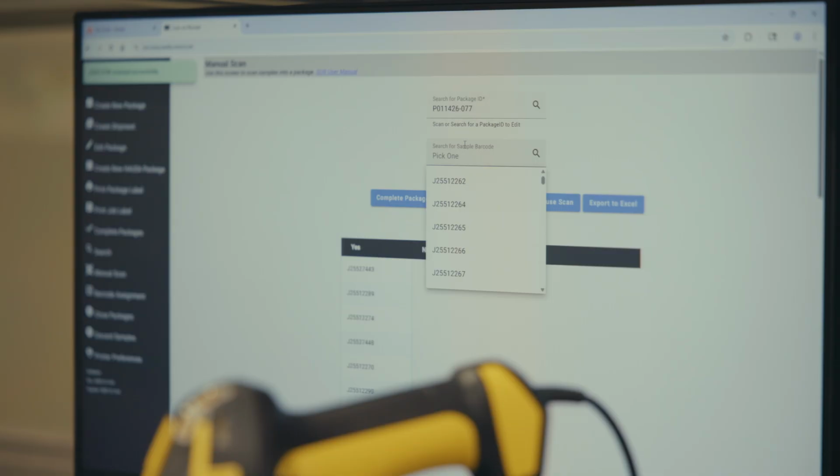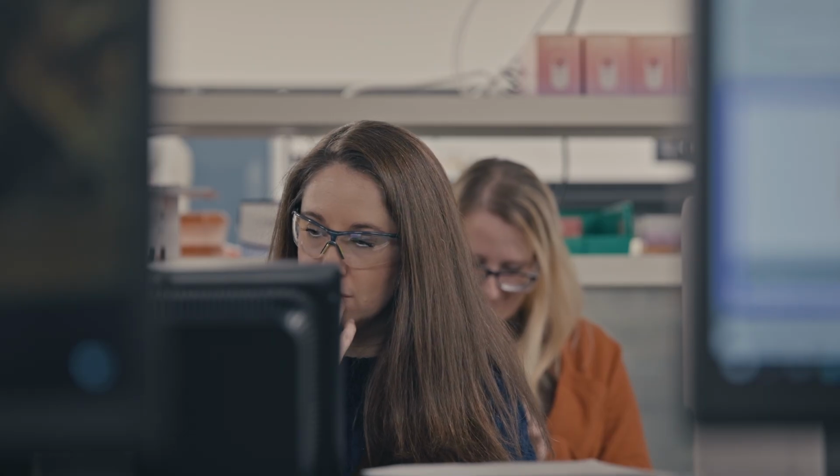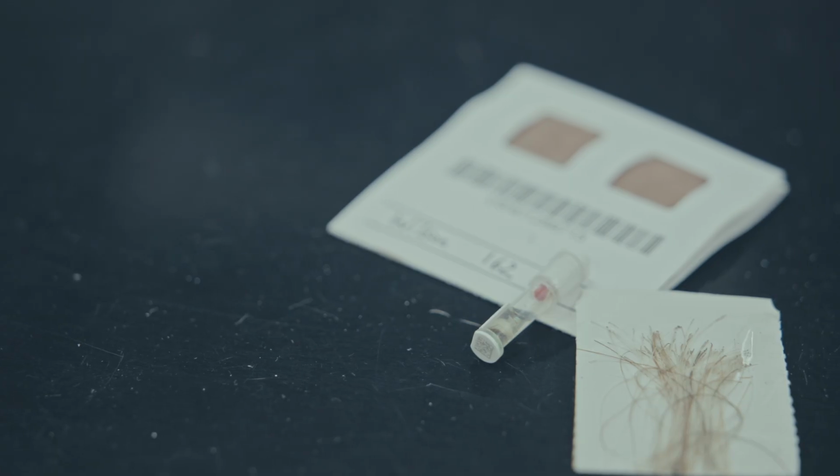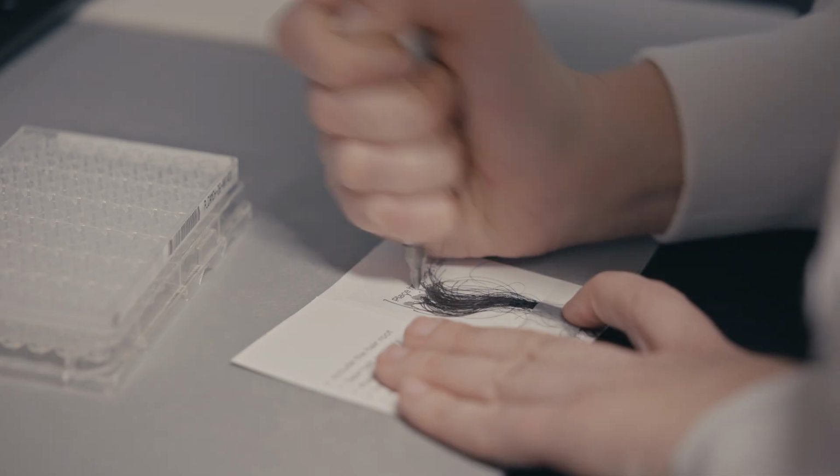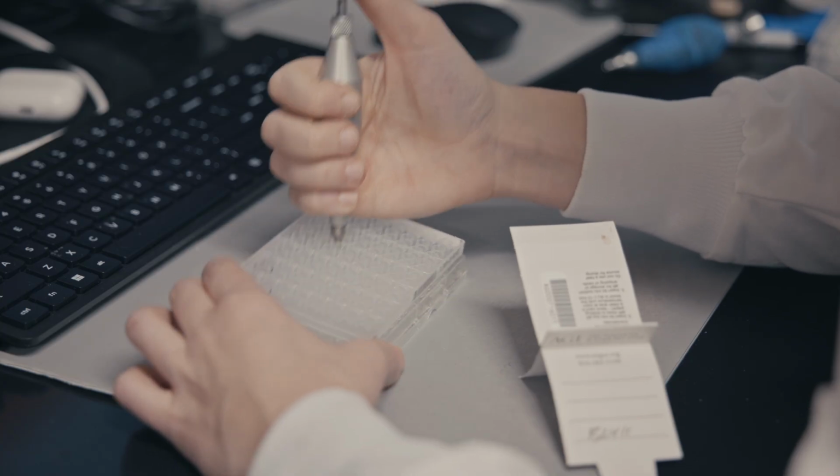When we make that connection, that kind of starts the processing within the lab. As soon as we know that we have all the information, it should come into our lab that same day. Then one of the members of our team will go ahead and handle that individual sample and put it into a plate. We're just getting that tissue sample, that hair card, that blood card, a section of it into the plate. Samples are only touched the one time. They're plated in the location and they live their entire life cycle throughout the lab in that one location.